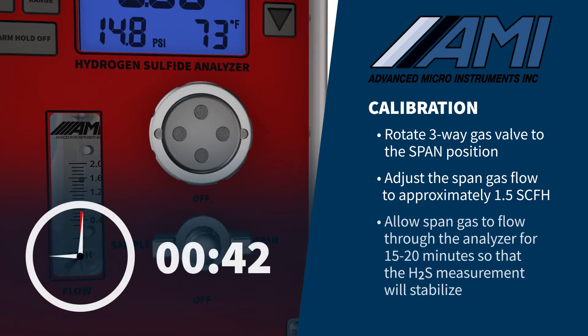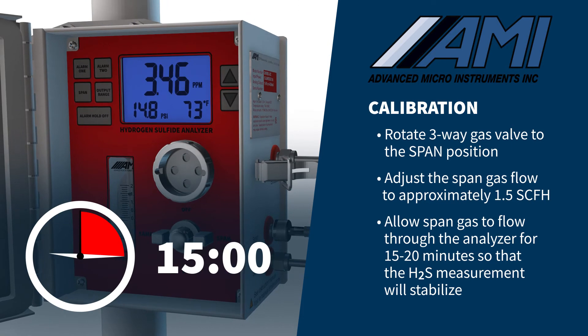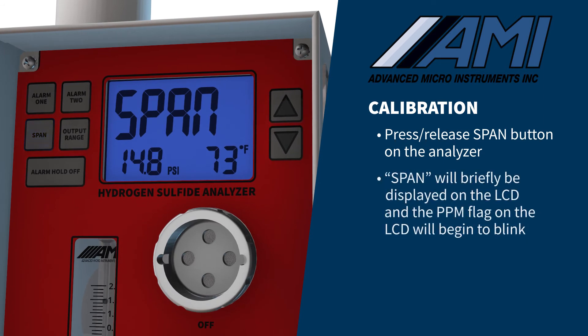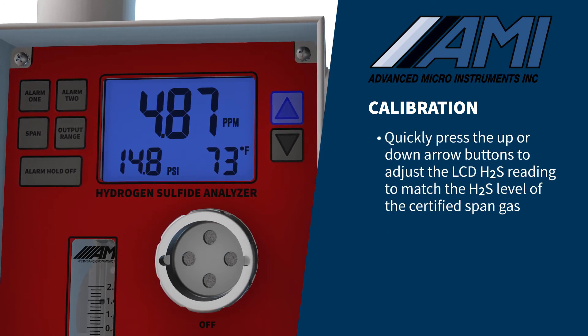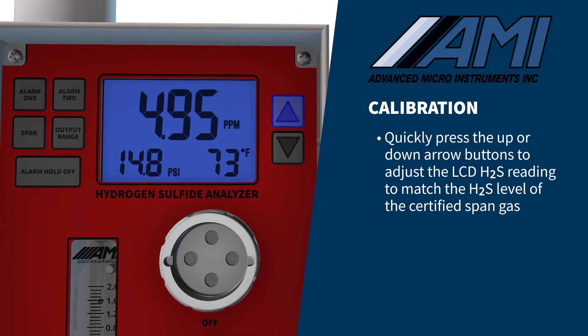Allow the span gas to flow through the analyzer for 15 to 20 minutes so that the H2S measurement will stabilize. Press and release the span button on the analyzer. "Span" will briefly show on the analyzer LCD and the PPM flag on the LCD will begin to blink. Quickly press the up or down arrow buttons to adjust the LCD H2S reading to match the H2S level of the certified span gas that you are using.